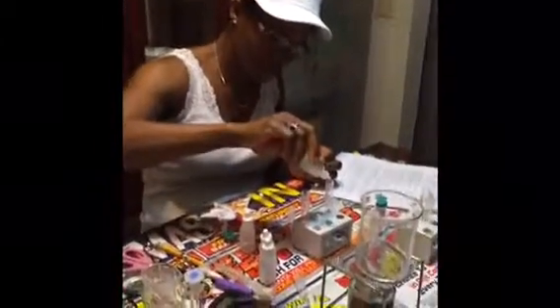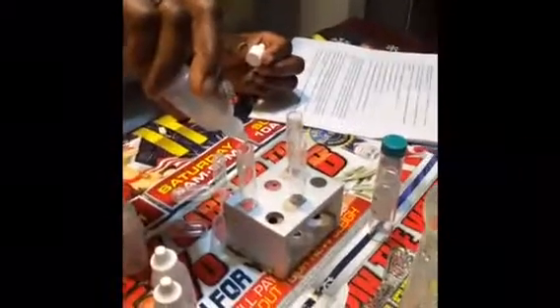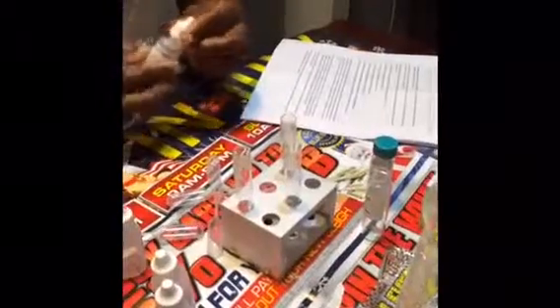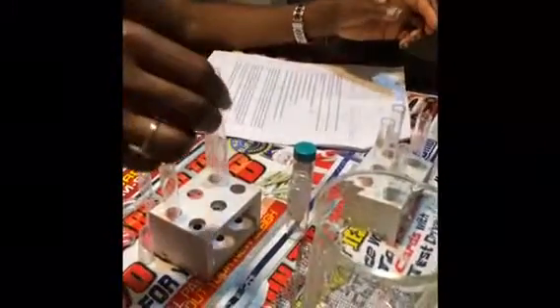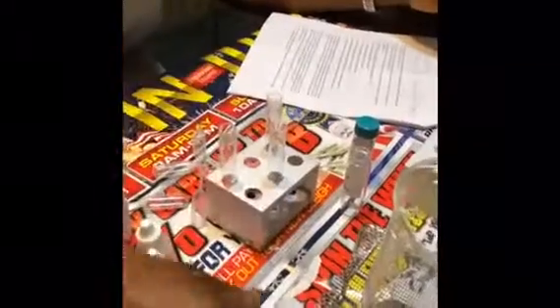2 drops of sulfuric acid. Now I'm gonna gently shake as instructed and swirl and agitate the test tube to mix the acid and alcohol. Agitating, mixing. I'm gonna set up my burner now.